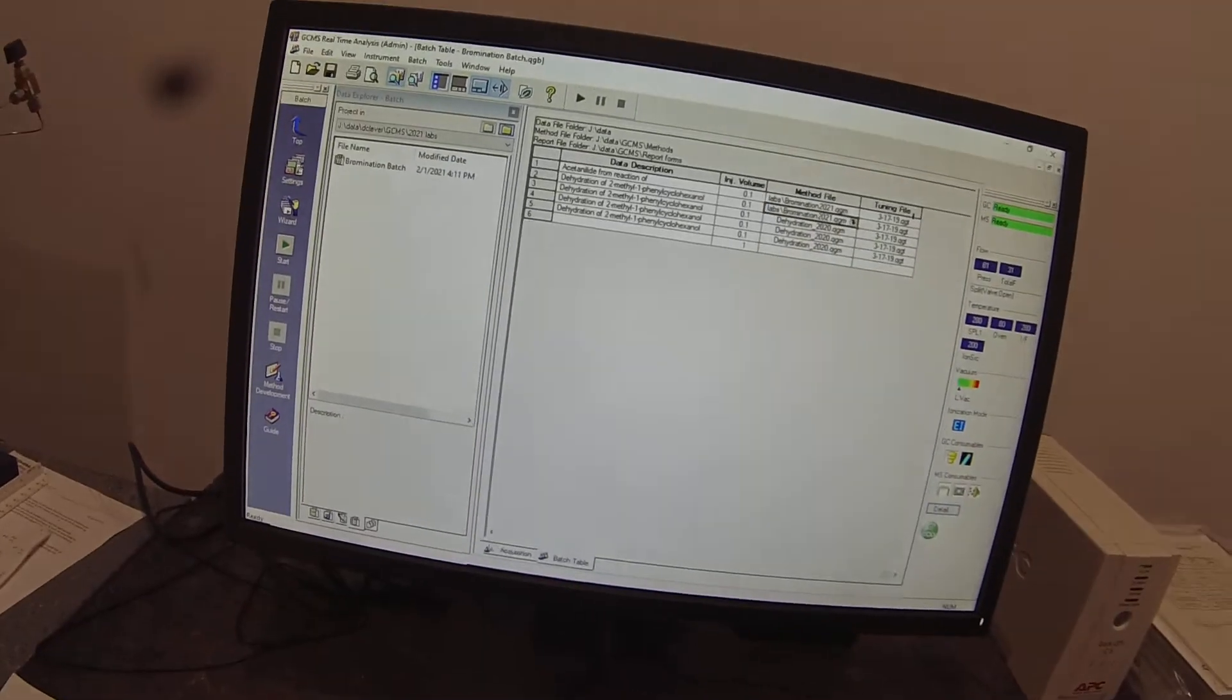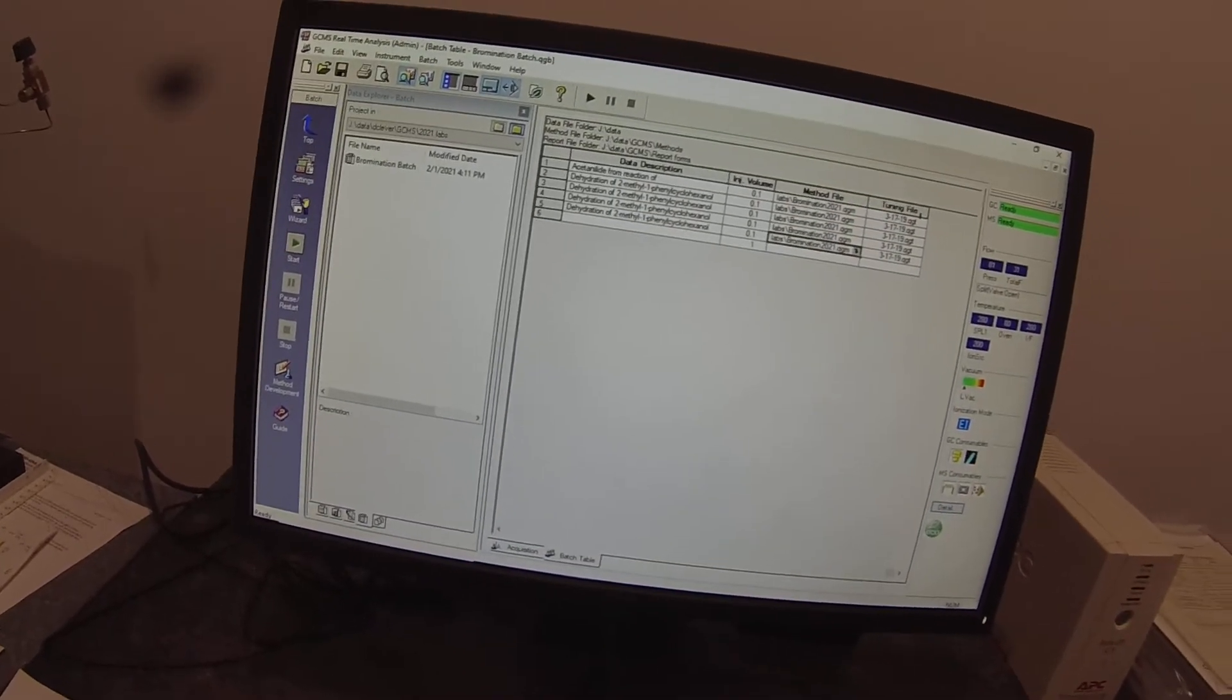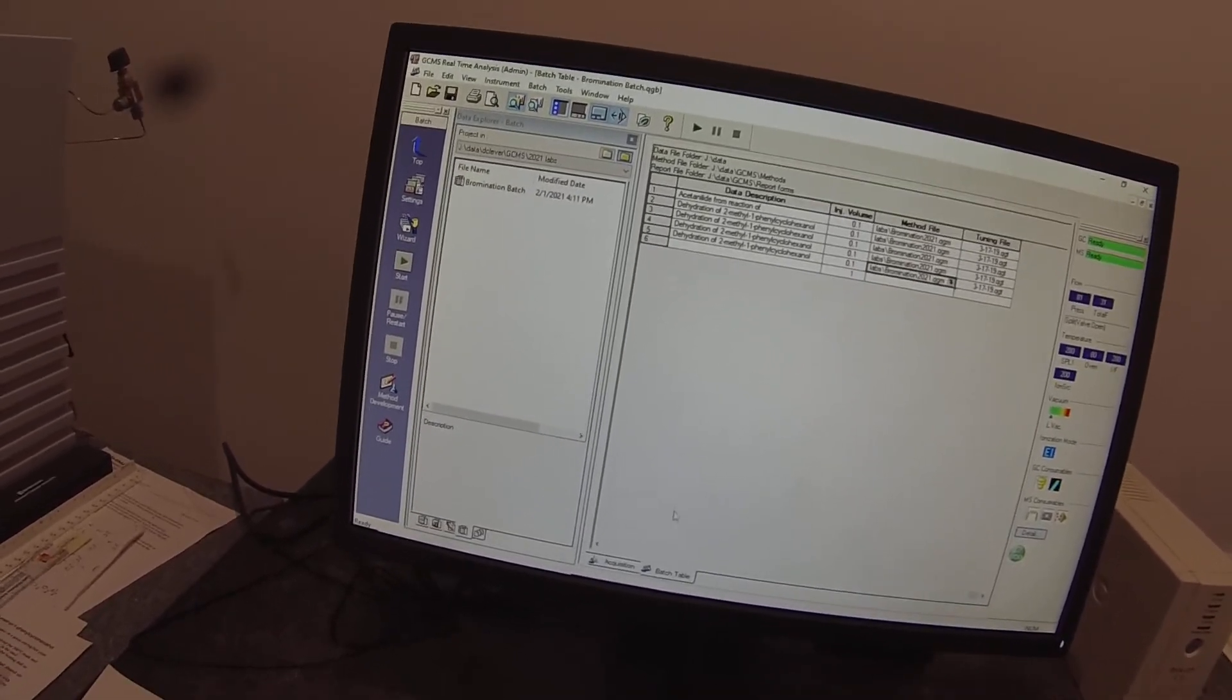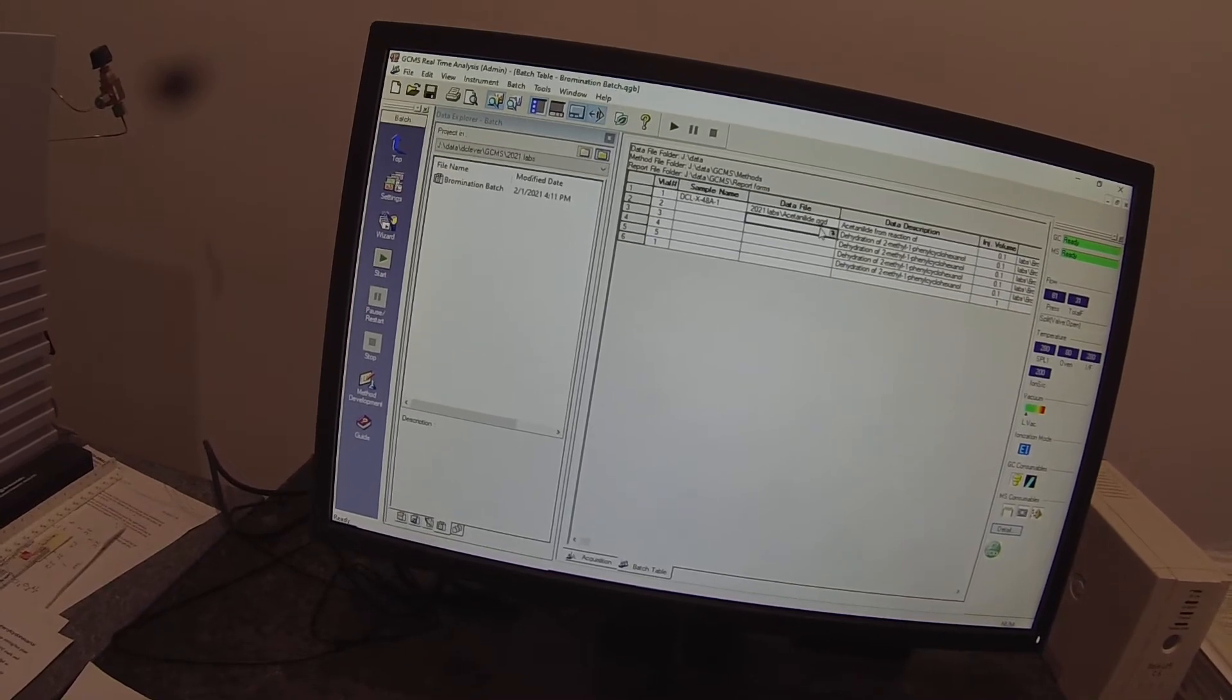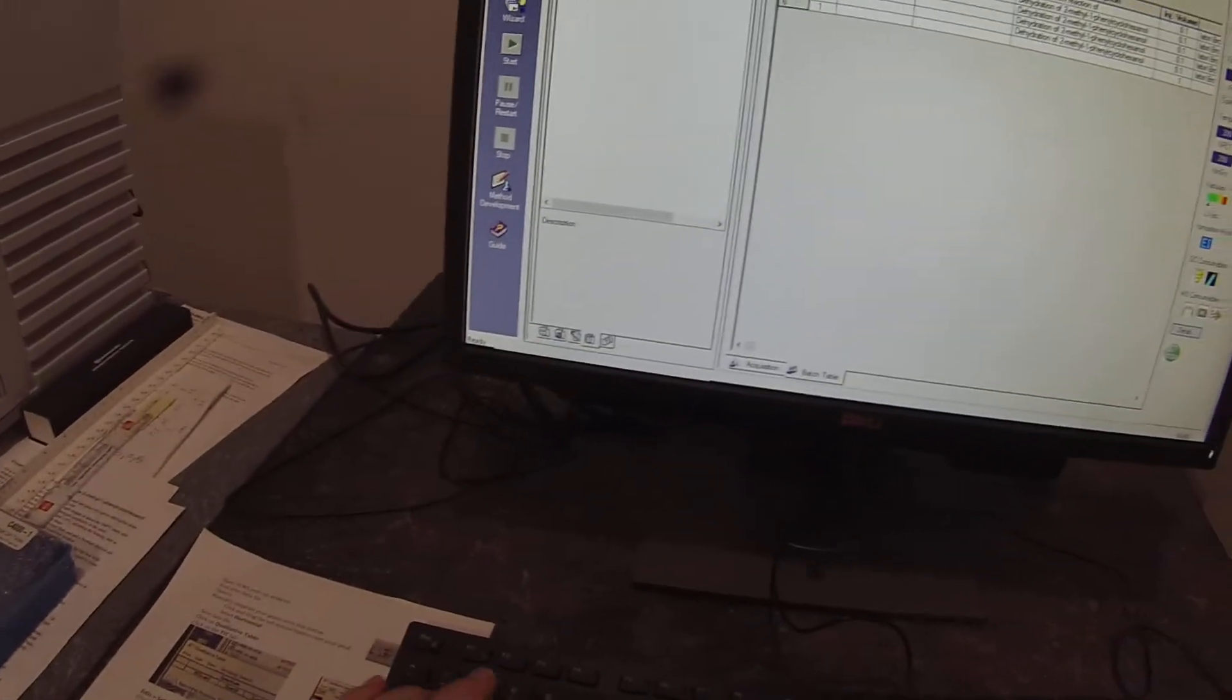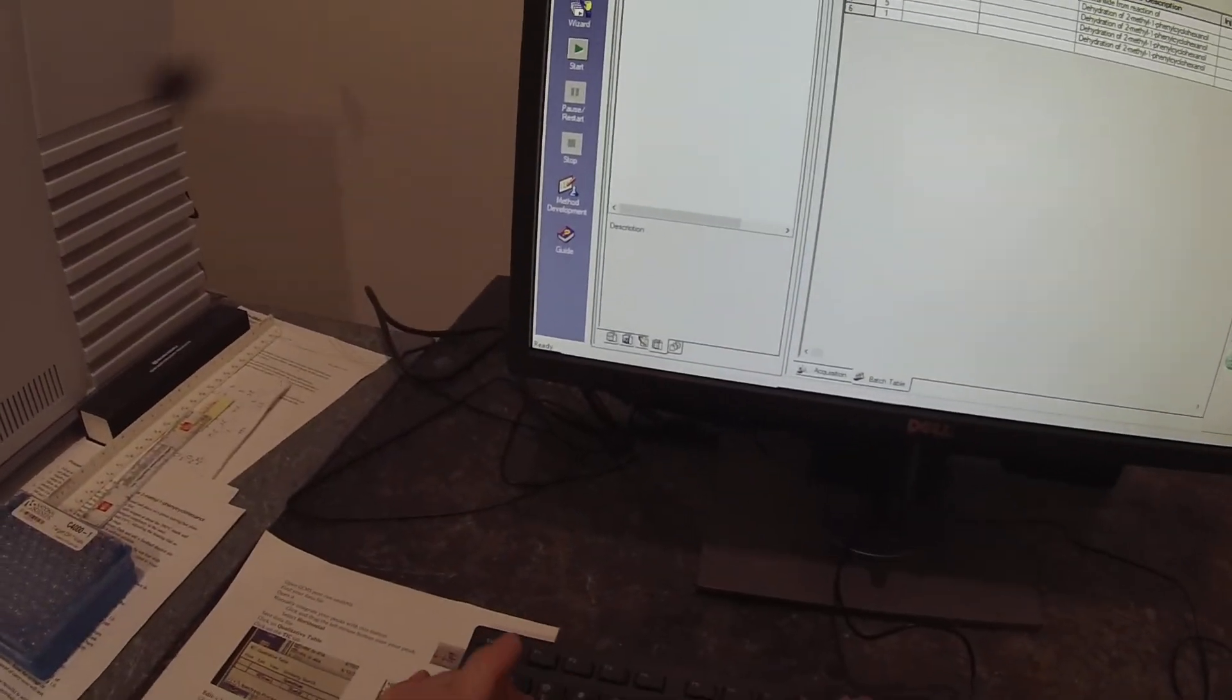Control C and put that in the other rows. And then we have 49A.